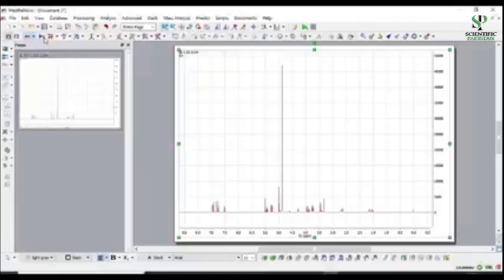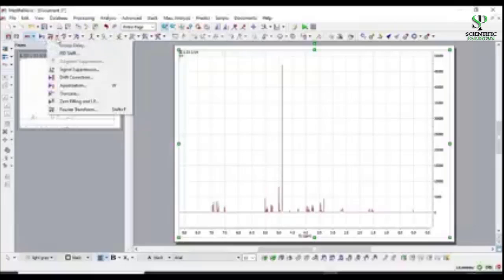Okay, then here we have the apodization. So apodization is also like cutting the FID. We will not go into detail of what apodization means, but that is to cut the tail of the FID. You can do that with the help of this, and you can see a small scissor here at the tail of the FID. That suggests that you can cut the tail of the FID using this option, right? This is the Fourier transform option, the drop down, and you can see that you can do different types of corrections, apodization, truncation, zero filling, and Fourier transform with this, right?